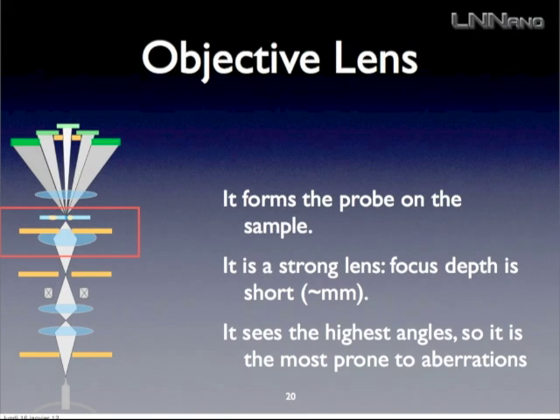And in the case of STM, I think it's a relevant question to ask, because after all, as you see in this diagram, which is not to scale, with this condenser lens, you are able to make a probe, a sharp probe, or even sharper maybe here. So what's the difference? The difference is that this guy is not to scale at all. And the objective lens is very strong. It has a very short focal length, which means it makes very huge angles. So the real responsible for making the probe is the objective lens.